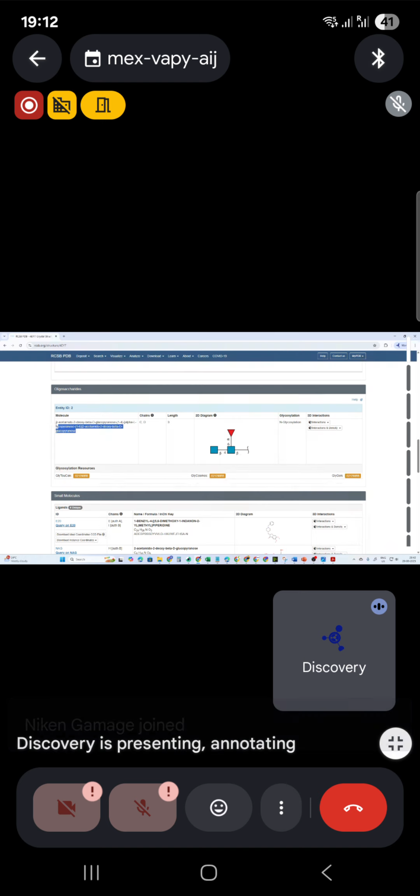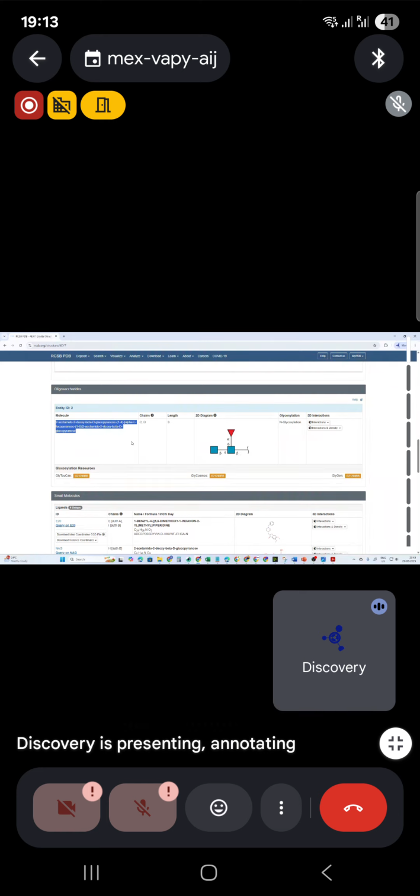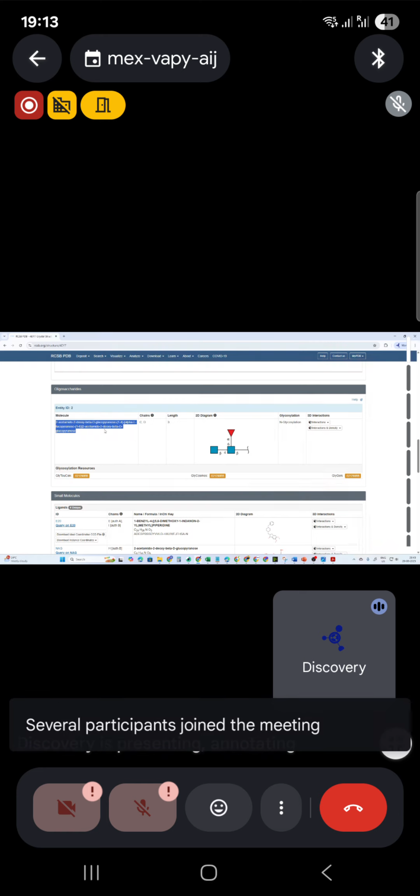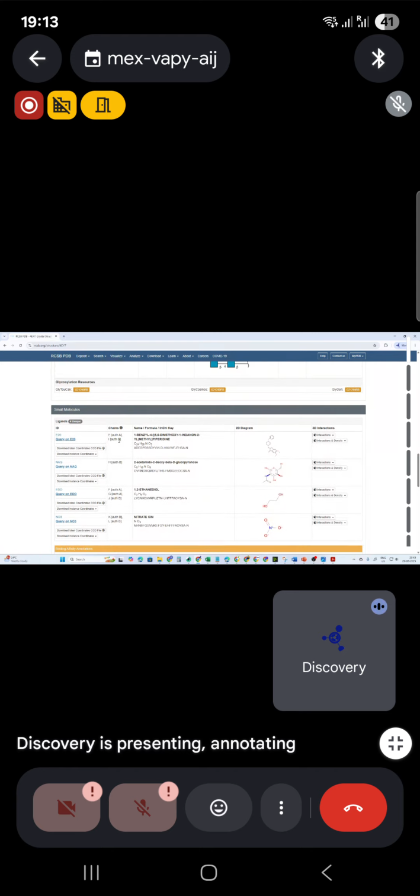So simply we can remove these. Probably during crystallization, they might have put these in for stability or something. We don't know, but yeah, this is not biologically relevant for the acetylcholinesterase enzyme. So I'm going to remove these chains also. These are unnecessary chains. Okay, so C and D also we are going to remove.